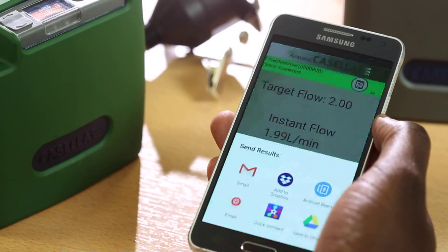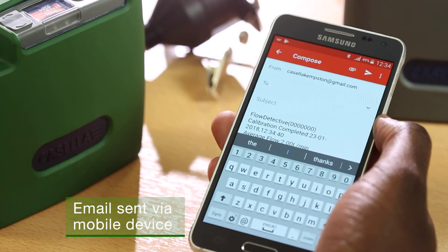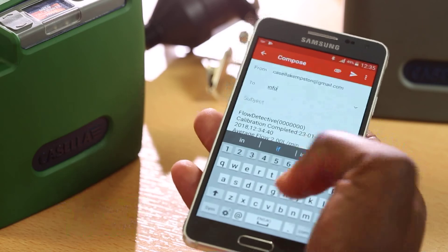Once the calibration is complete, data can easily be sent by email, providing a log of the calibration and ensuring you have the traceability and peace of mind in the air sampling you've done.